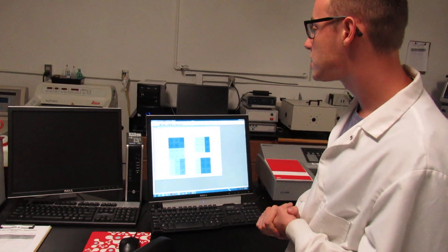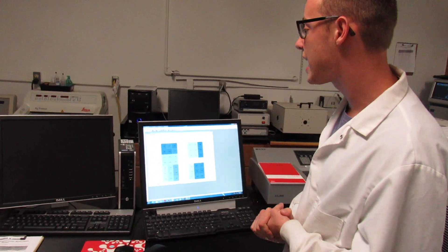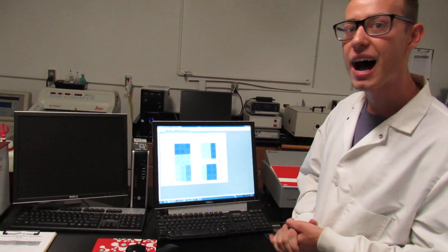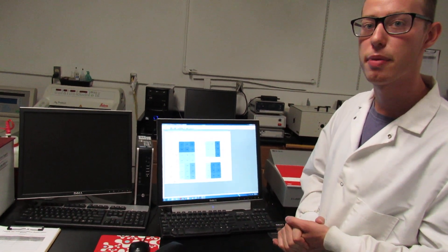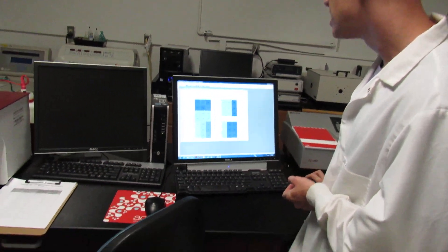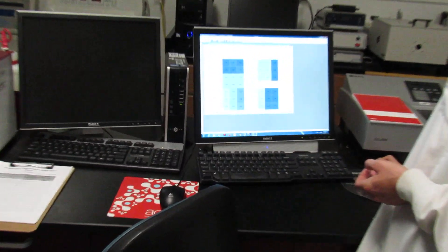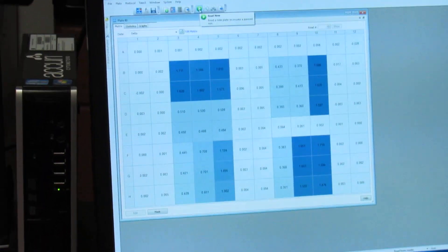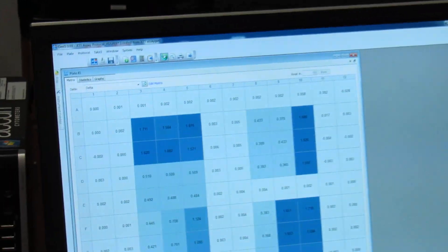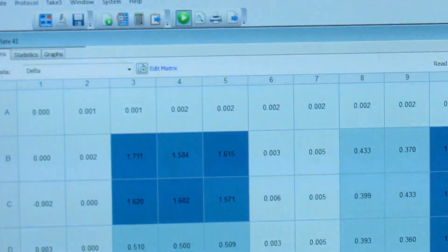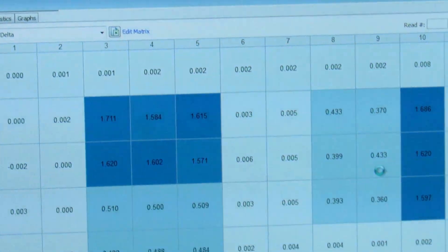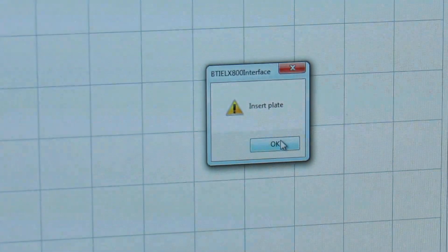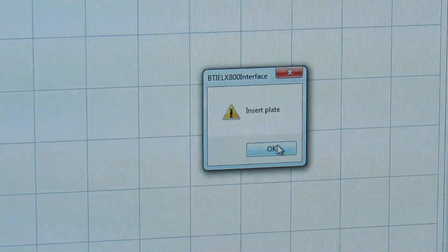In class, we are going to run an XTT assay for hour five and we are going to compare that with all four of our sections. To begin, you'll hit this green Read Now button and select that. You'll be given two prompts. The first prompt will tell you to insert the plate, which we have already done, so you can hit OK.